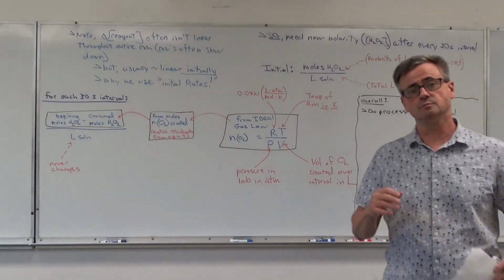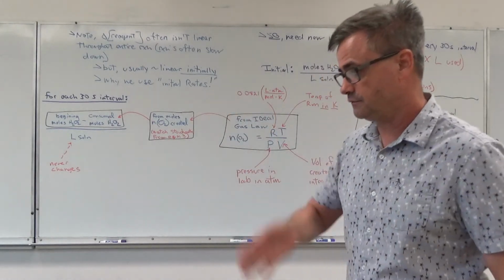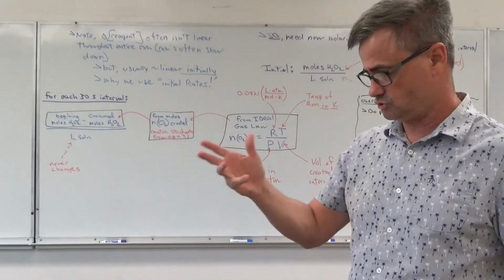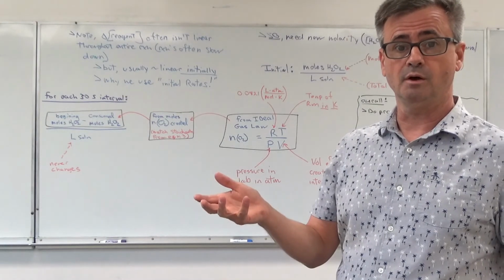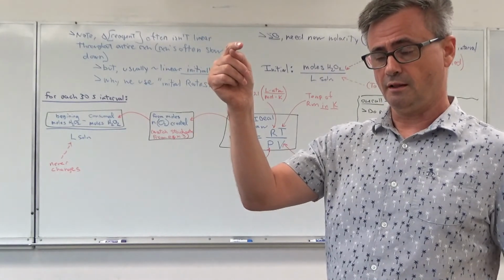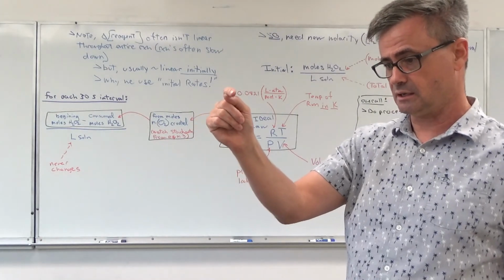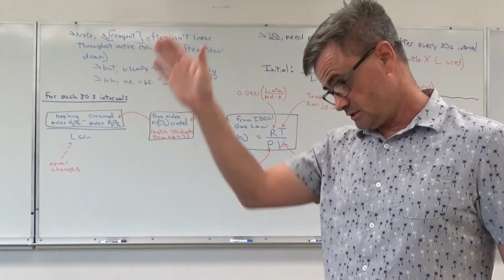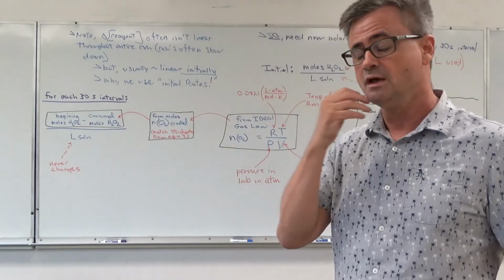Part of that is going to be carefully doing your Excel columns. The first column, I believe, is going to be the volume of oxygen created, okay? And then simply the last burette reading minus the next burette reading gives you the volume created in that interval. Okay, once you know the volume, then the next Excel column needs to use the ideal gas law to figure out the moles of oxygen.